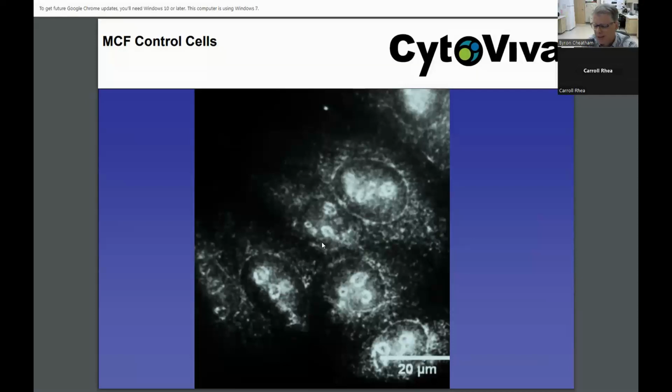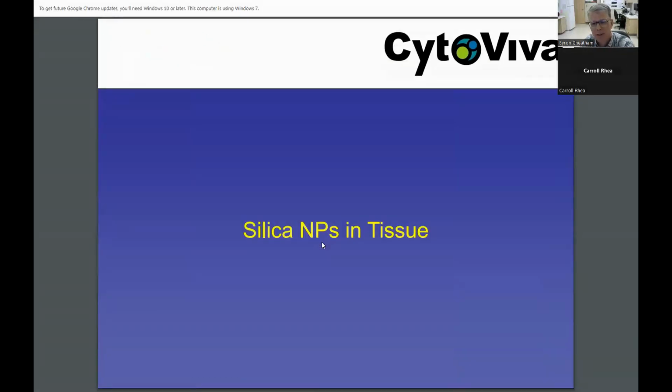And there's also a process, and I'm not going to go into it, where we can build spectral libraries of things like nanoparticles, filter them against negative controls to ensure that the spectral library for the nanoparticle target maps without any false positives. And there's a process for doing that. There's a special analytical tool in the software called Filter Spectral Library. The kinds of things that you would learn if you had a system in your lab.